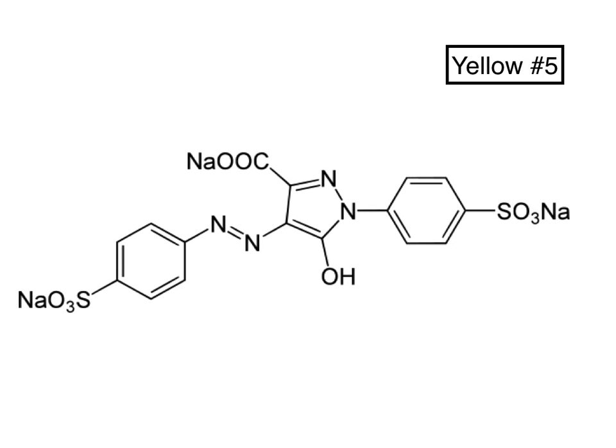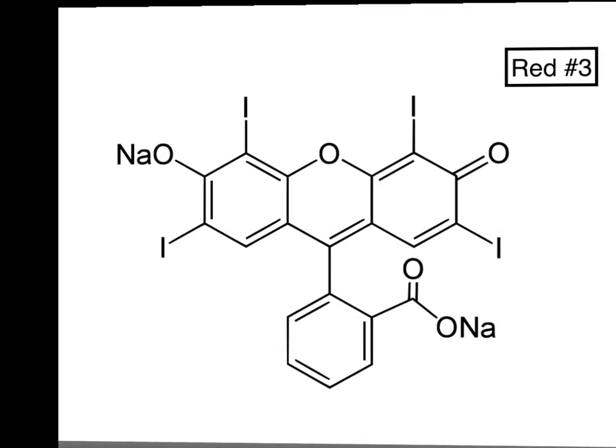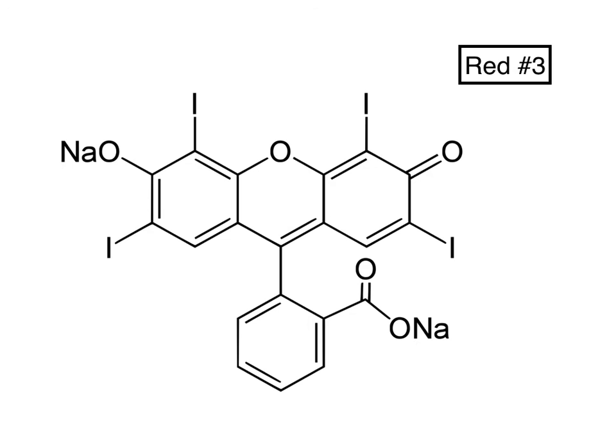The third dye, yellow 5, again a smaller molecule compared to the blue dye, but again you can see sulfate groups at the far ends and a hydroxyl group in the middle. Again, you've got those rings of carbons connected to each other, lending a large degree of non-polarity to those sections. And then finally red 3, again a lot less polarity. There are those oxygens that are in the rings and coming off the edges of the rings that lend some polarity. You can see how sodium ions have associated with it.